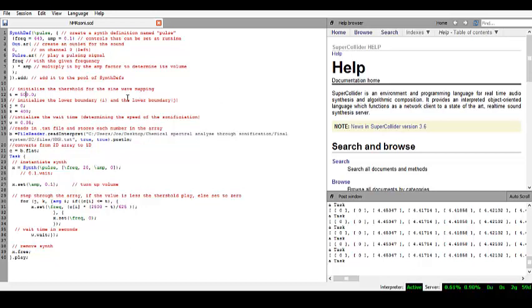I mean, obviously we still have the user interaction elements to add in, and that will be done later with the external interface. We'll just have these parameters here set, and that will really allow us to navigate the spectrum as we wish.